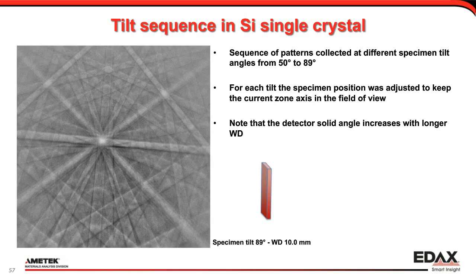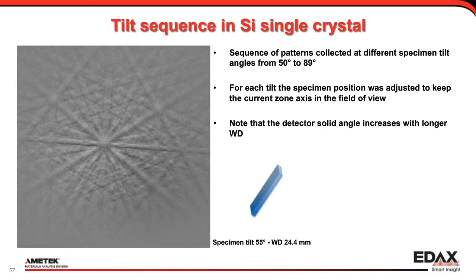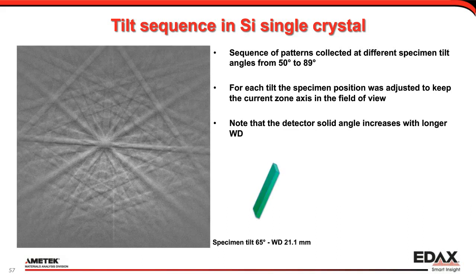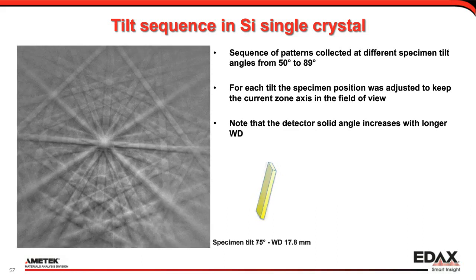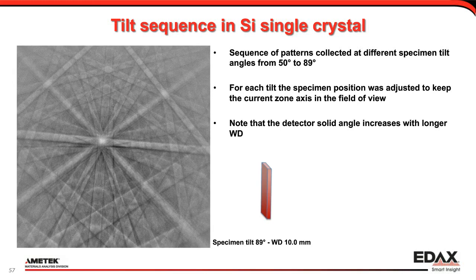And if I play it again, you can see that you get more contrast in the bands at 70 to 80 degrees. And if you go steeper than that, a lot of the contrast disappears again, the band gets flat, and the band edges get very sharp.